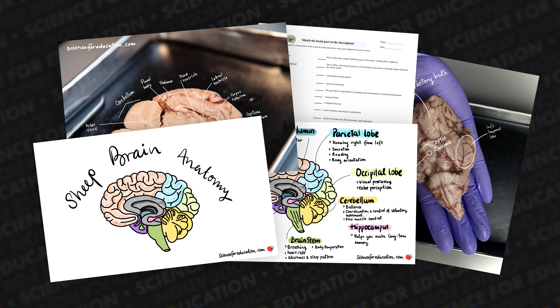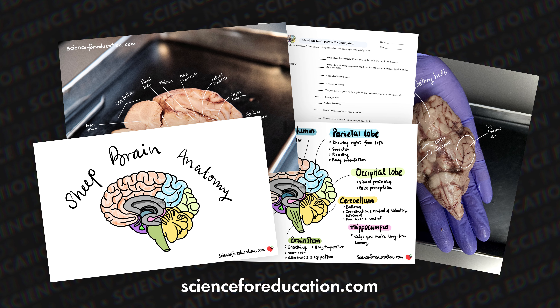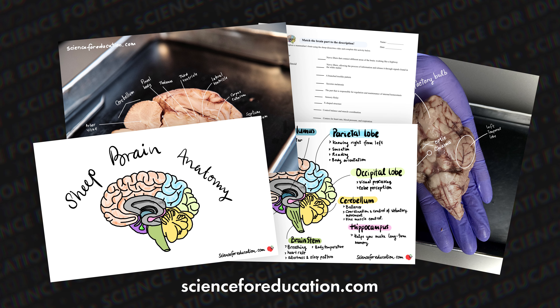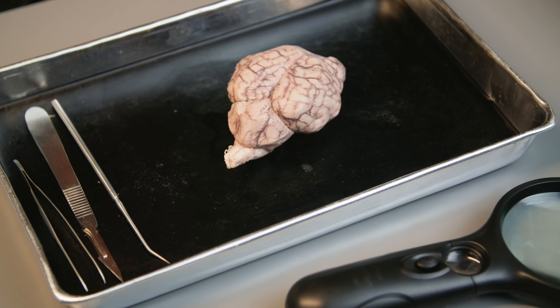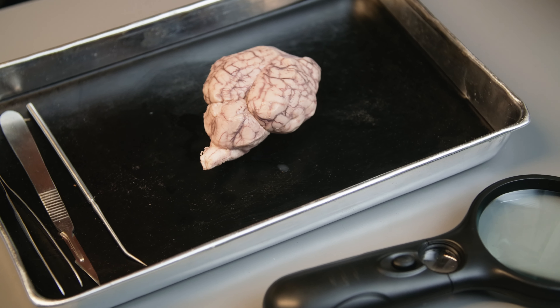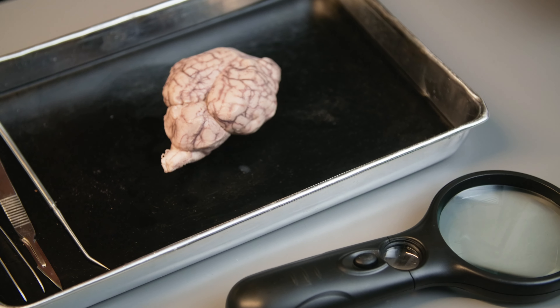You can get the activity sheets through the link in the video description below or you may visit scienceforeducation.com. In this dissection activity, we will need a dissection tray, a scalpel, forceps, teasing needles, a magnifying glass, and a sheep brain.